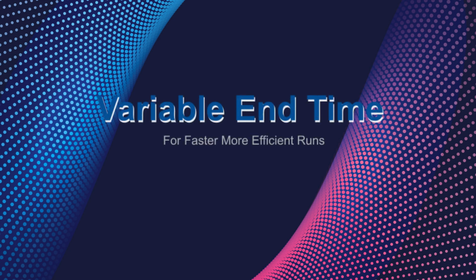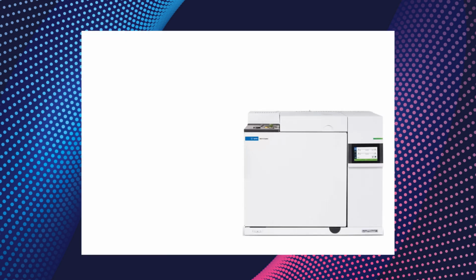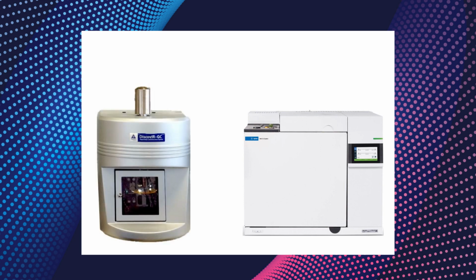Now we are moving on to the variable end time setup. The user can choose to have the end time be a set end time where all Discover runs will be the same length, or have the end time be variable. The variable end time involves setting up an external event on the GC method. This sends a signal to the Discover to stop the run after collecting data from the optics bench.